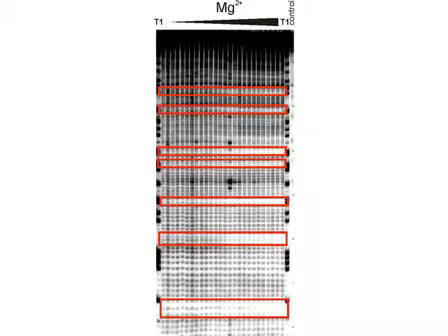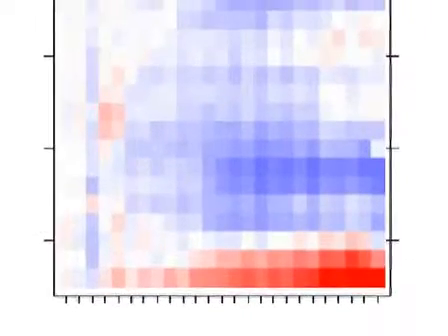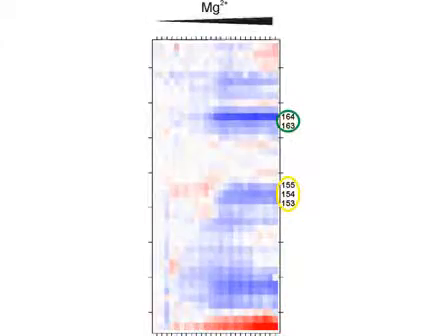Protection refers to single or groups of contiguous nucleotides whose cleavage changes concomitantly. Band intensities are quantified and normalized by SAFA analysis. The output is a thermal plot visualizing the degree of protection against hydroxyl radicals. The color transition describes the accessibility change upon magnesium ion addition. White to red shows more accessible nucleotides, whereas white to blue shows more protected nucleotides.